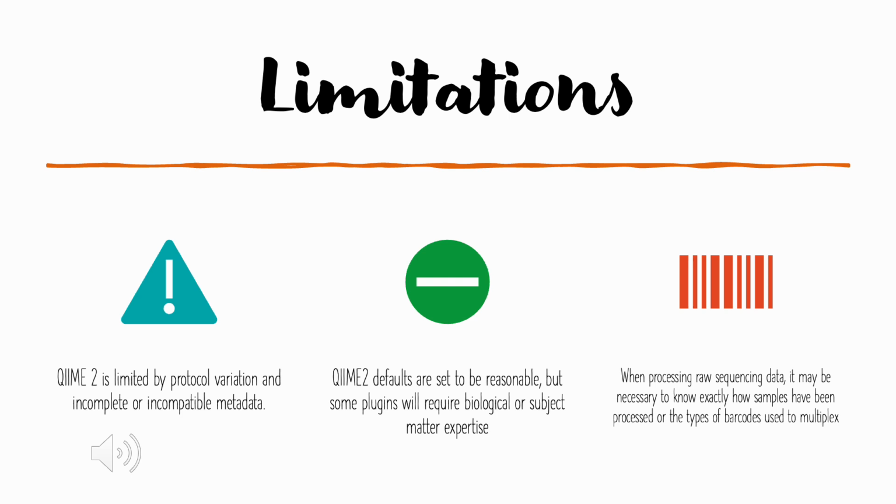Another big issue is some of the plugins require a subject matter expert. So you might not be there. It's not always plug and play. You might need to have some sort of person on your team who has that specification, who can understand, like, oh, this sequence is biologically important to be conserved. No, it is not an error. We need to keep it in there.